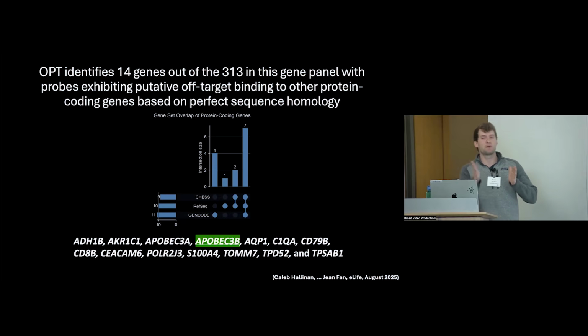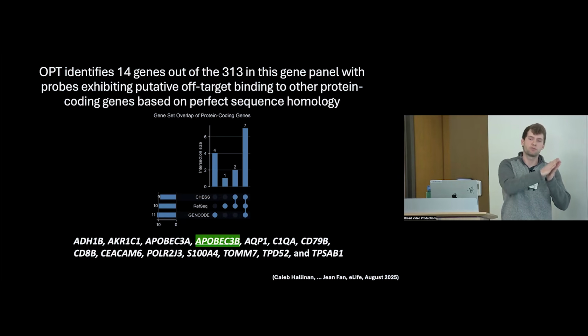So maybe I didn't explain it well. The probe is binding to a gene, and then you perform this rolling circle amplification, we get this product, and then we take a picture. So whether it's one probe that was the problem or multiple probes, we'll still have that probe bind to that target and get that product and take a picture.